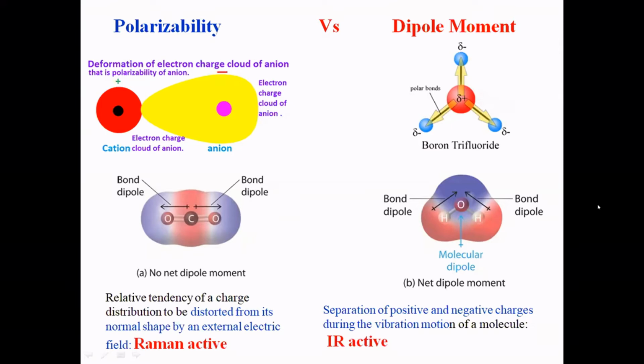So the electron clouds are not stable within the structure; they keep on oscillating to either side. This has a positive effect in scattering the light. This is called polarizability. This polarizable nature is highly helpful in scattering photons or electromagnetic radiation, so irrespective of the symmetry of the material, we will be able to get scattering.